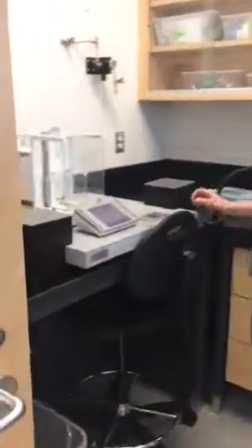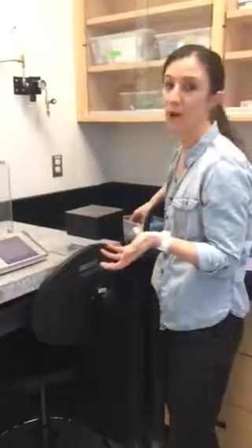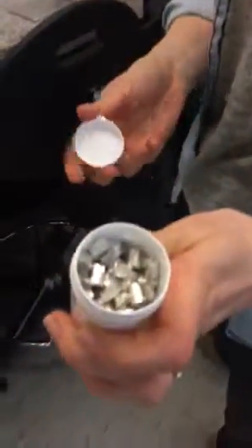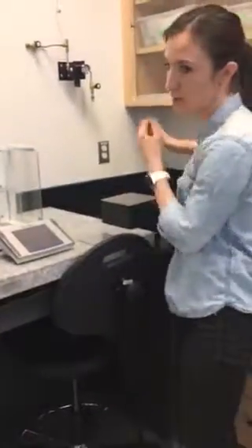And we only really need a tiny little bit of material. So it's about the mass of a few eyelashes. And we weigh the samples into these little tin capsules. So for charcoal, because it's 70% carbon or 60% carbon, I'm going to weigh about 2 milligrams of charcoal because that will give us just over 1 milligram of final carbon.